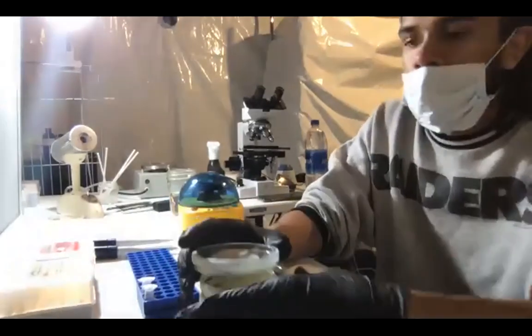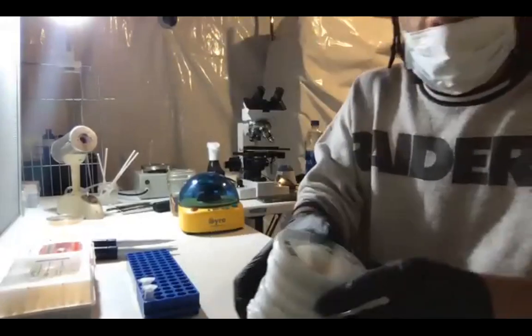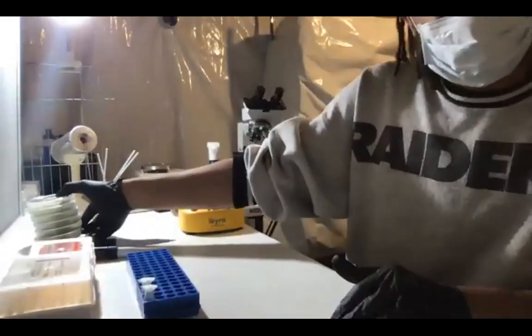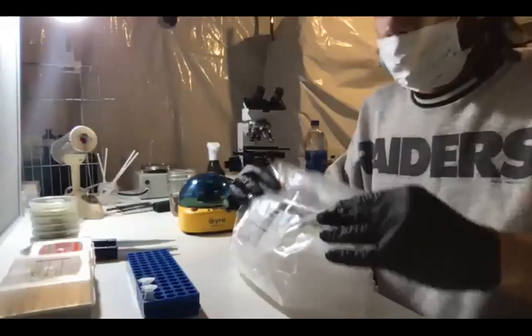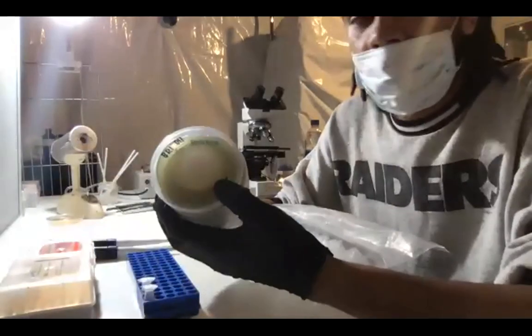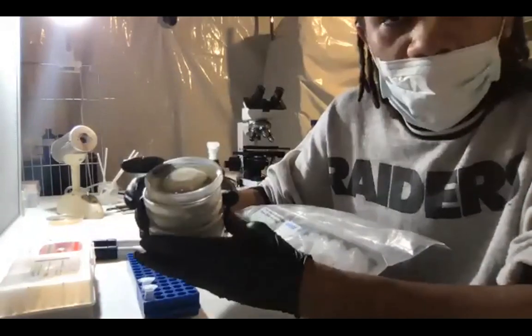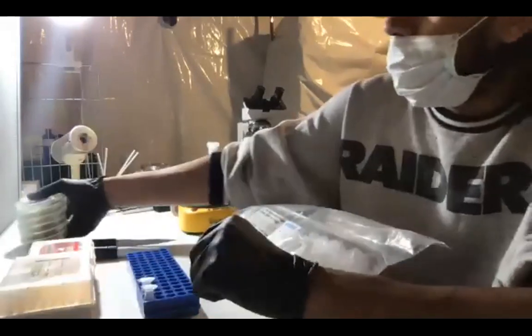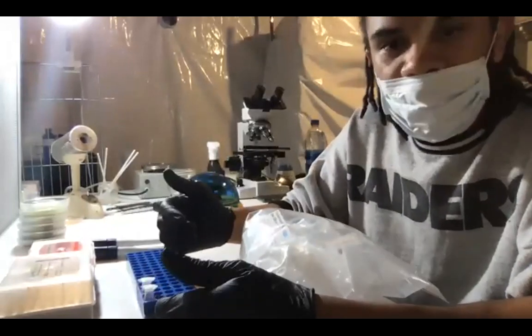So I have 6 samples today that we're going to run, 6 isolates. So we'll talk about this a little bit more in the presentation that's going to come after the demonstration about how you can get isolates. But yeah, if I did all my work properly, all of these are single ascospore cultures. And we'll be able to tell if I messed up and they already mated when we do this mating type PCR run.